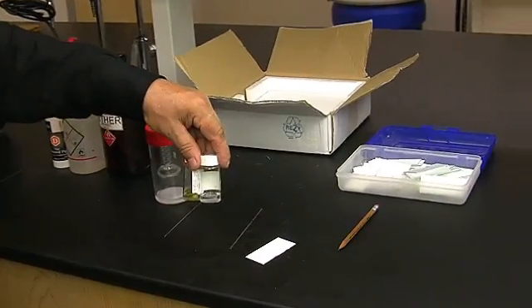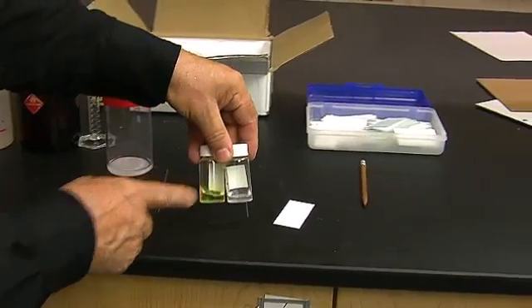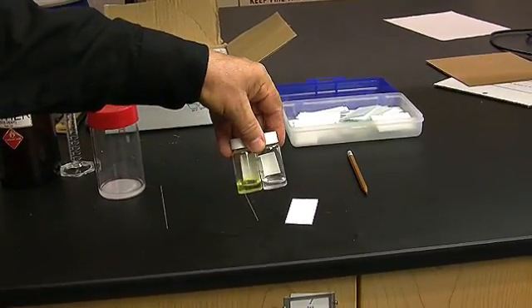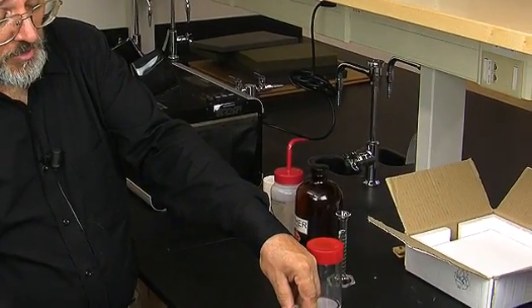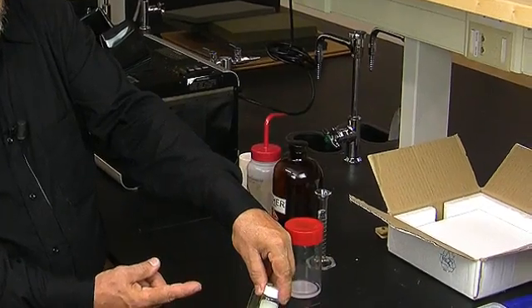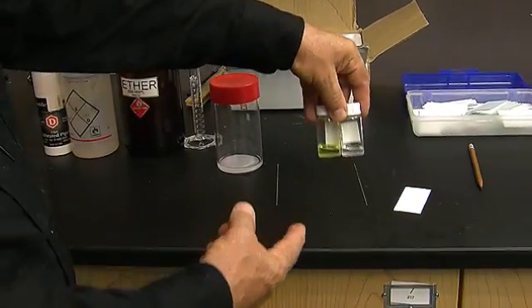Here I have two solutions that students have provided. The one on the left, the yellow solution, is a solution of fluorenone — which is a naturally yellow solid — in diethyl ether. The one on the right is a solution of benzoic acid in diethyl ether. We're going to use these solutions to demonstrate TLC.